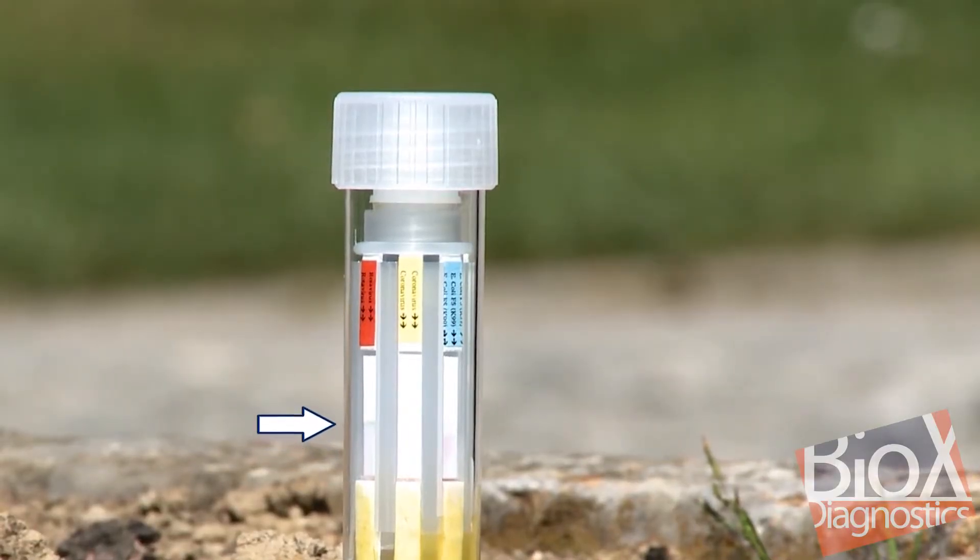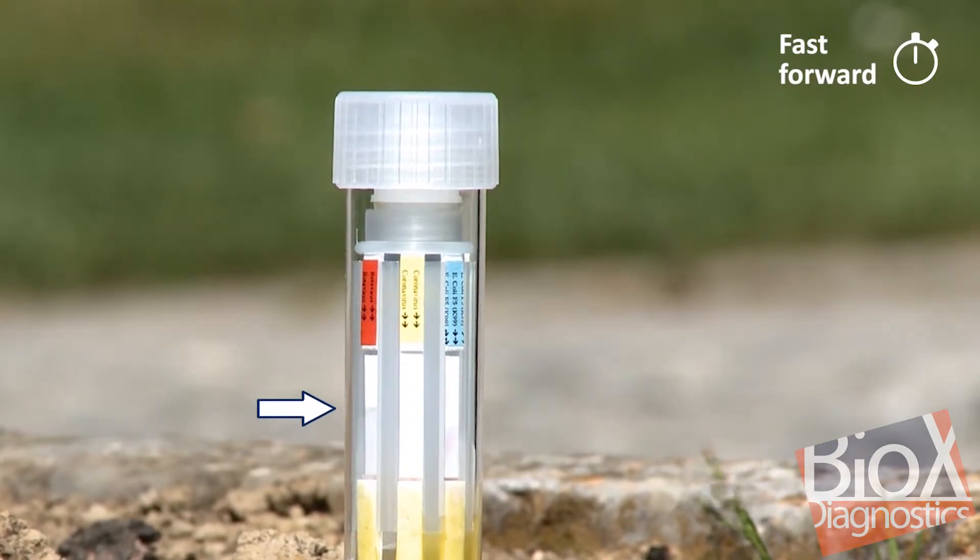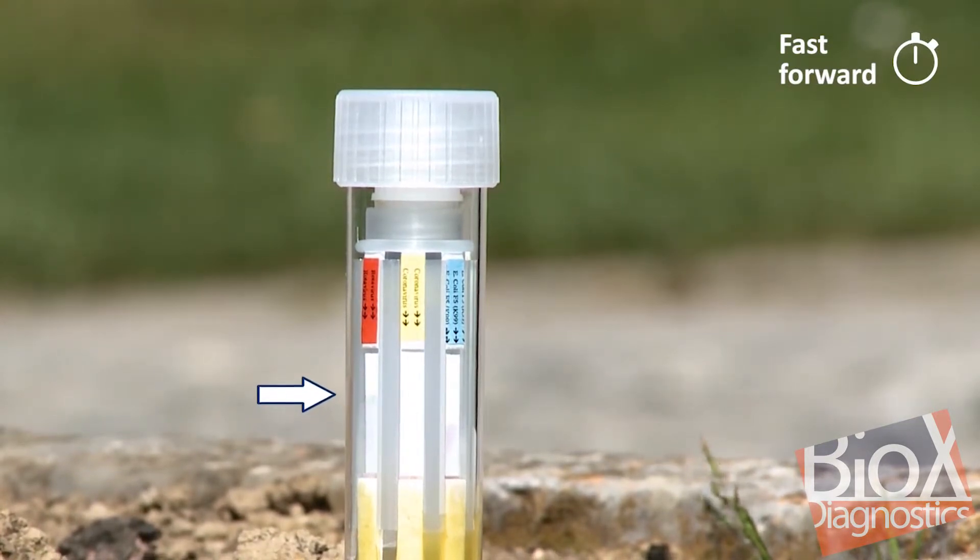Then, wait 10 minutes without disturbing the tubes. During this period, it's possible to follow the liquid sample's migration up the strips.